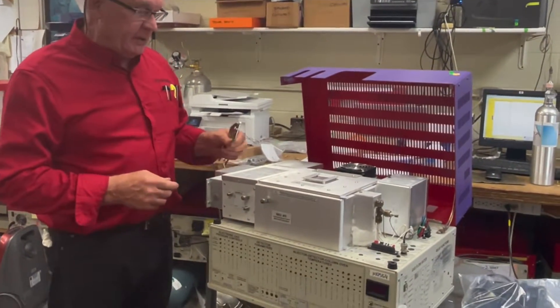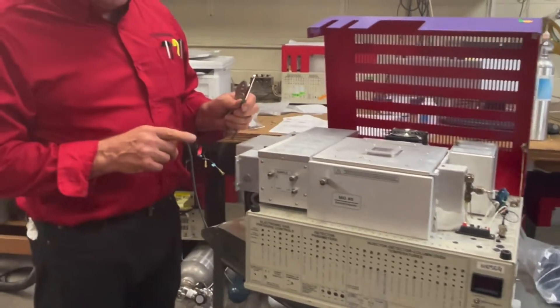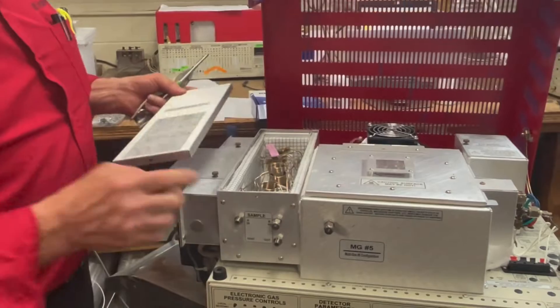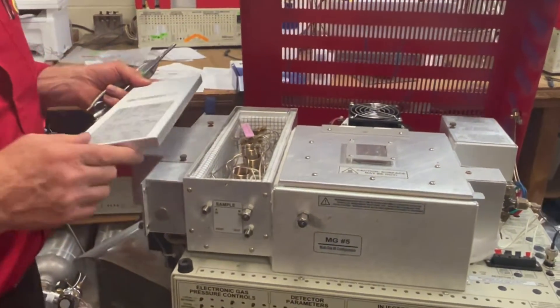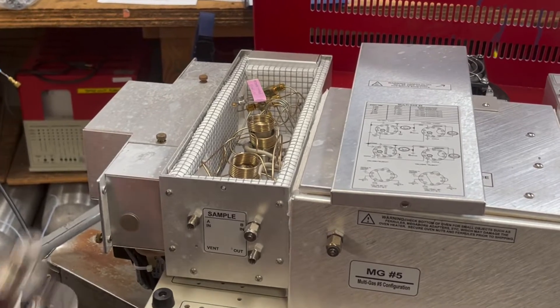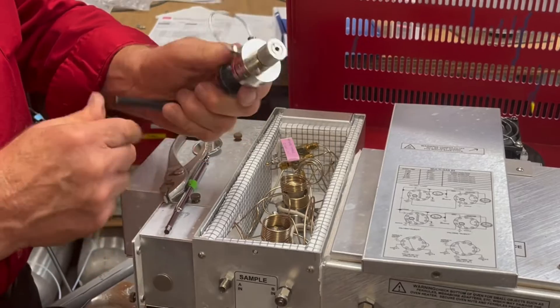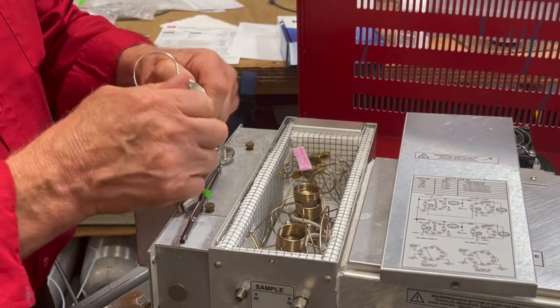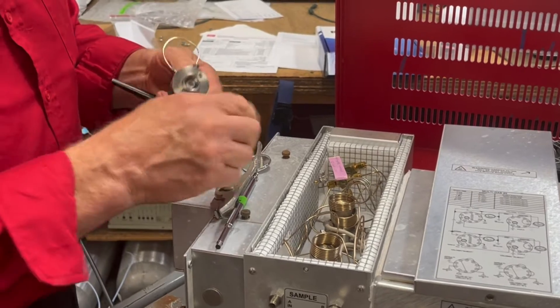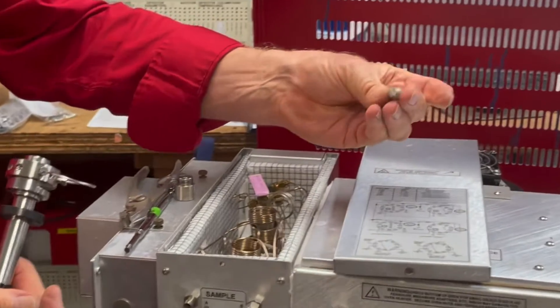Hi, my name is Hugh from SRI, and in this video we're going to show you how to get the rotor out of the gas sampling valve. The gas sampling valve typically lives in this area here we call a valve oven. This GC has two of these valve ovens. We've covered the valve operation in another video, but inside the valve there's a part called a rotor. The rotor is what actually moves when the valve is actuated.